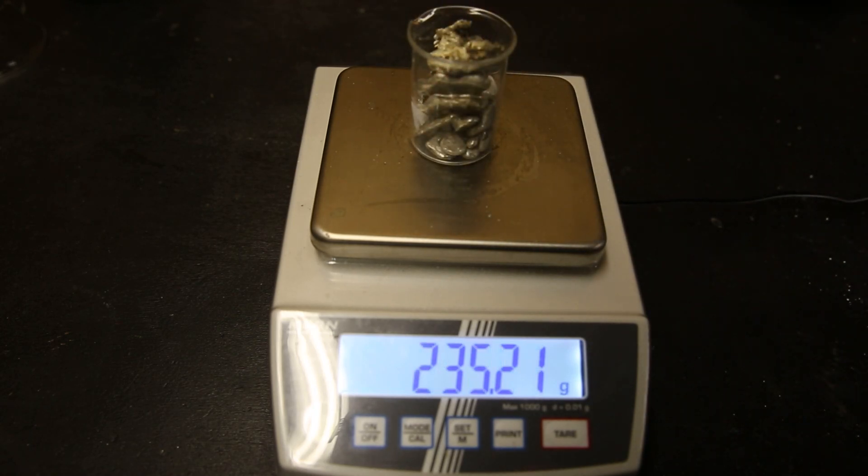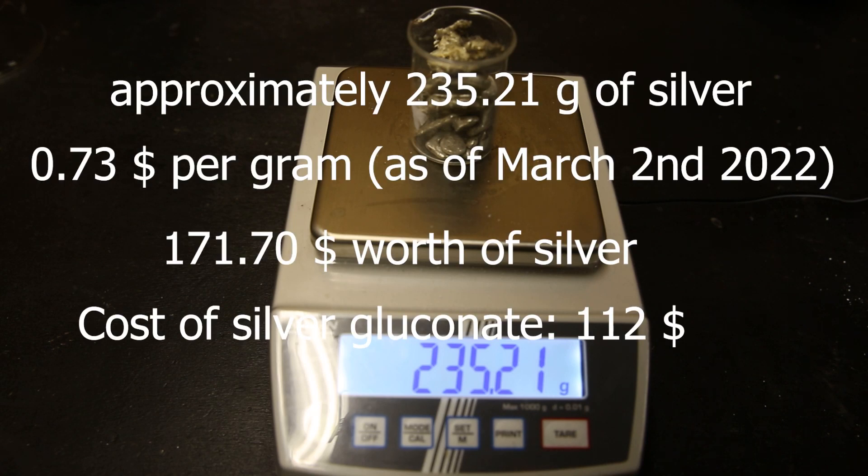So I have 235.21 grams of silver. So as of today, silver is 0.73 dollars per gram. Which means, assuming the silver is pure, it is worth 171.70 dollars. Which is more than what I paid for all of the bottles of silver gluconate, which cost me 112 dollars.